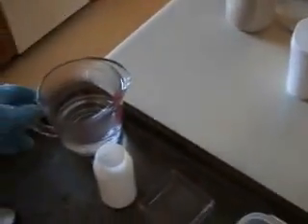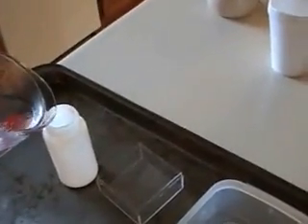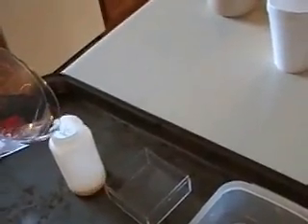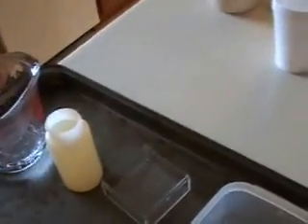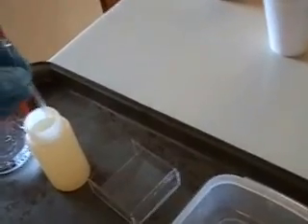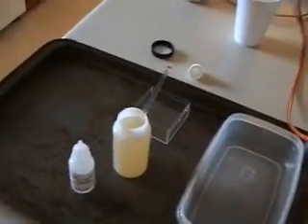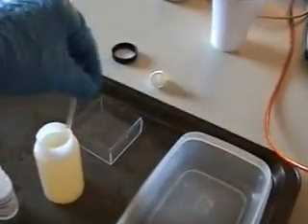Now what I'm going to do is pour in the boiling water up to the neck of the vial, and you can see it actually changing color right up to the neck, and then I'm going to go ahead and stir it and stir it and stir it. Now I've poured out the extra boiling water because I don't want to spill it on anything.